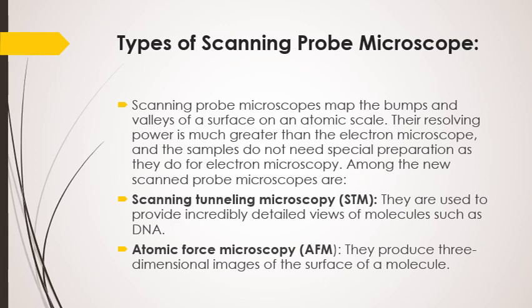First of all, I have a tutorial for you on scanning tunneling microscopy. In this tutorial, one explains in a very descriptive manner the working principle and the importance of scanning tunneling microscopy. So here we have the tutorial of this.